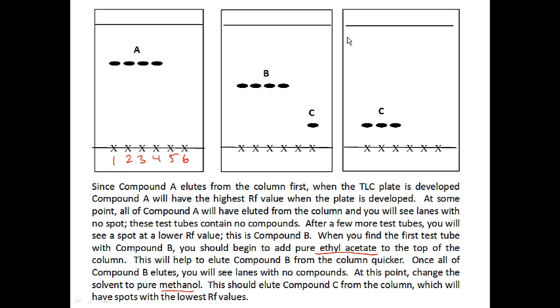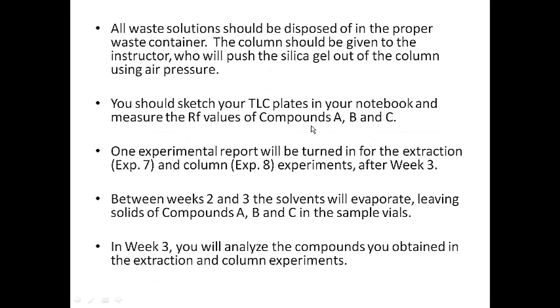Now, if it wasn't obvious from the spinach experiment, when you pull a TLC plate out, you need to make sure that you mark the solvent line. It's also important to develop each TLC plate to about the same position, so that when we line them up, we see the clear difference between A, B, and C in terms of their Rf values. Okay, so that's the end of experiment 8.